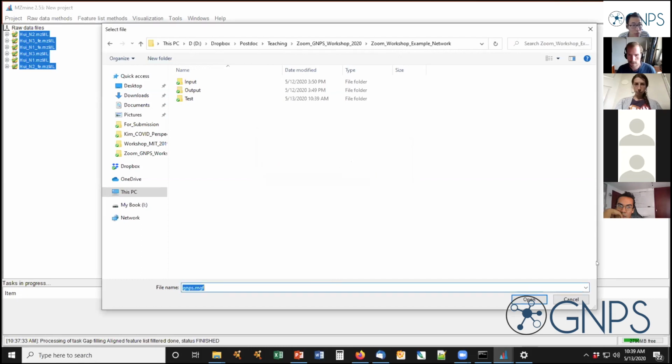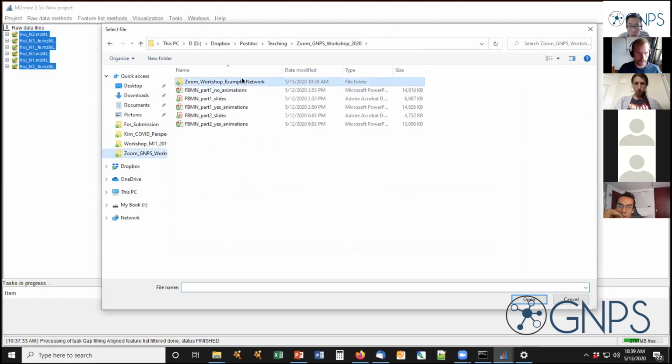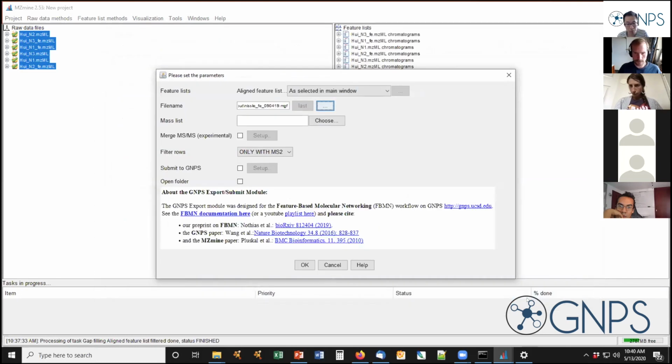Yes. Okay. It doesn't want me to save it, so I probably need to select an already existing file here. Okay, so that's actually probably not so awesome.